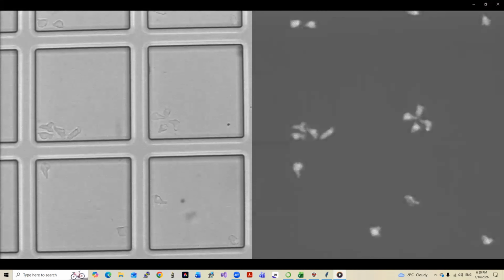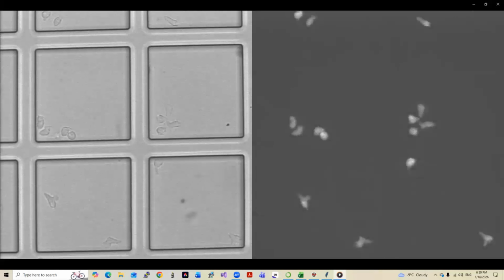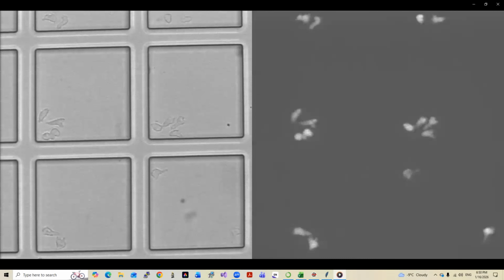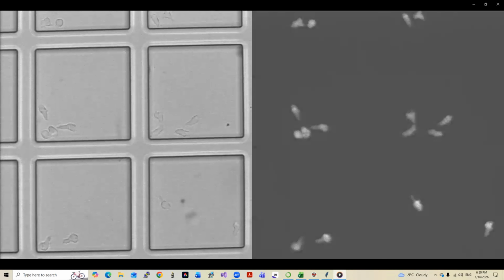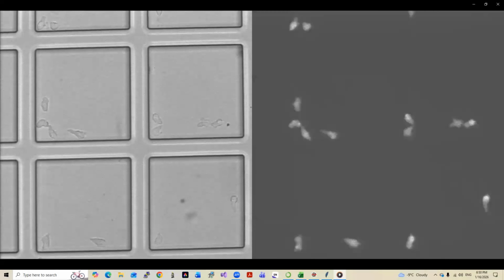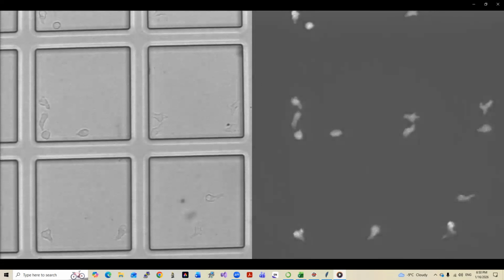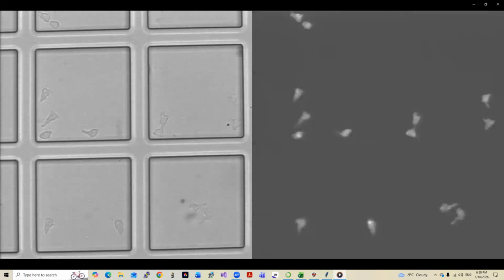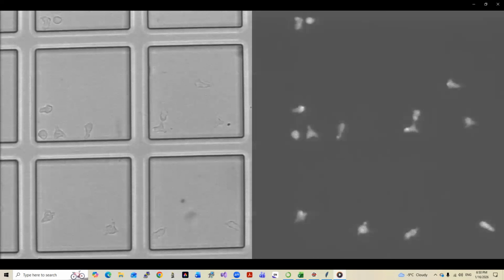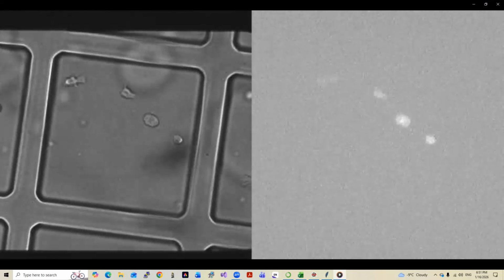Each frame of an input T-cell movie needs to be represented in 2 channels, the bright field channel and the green fluorescent one. The red fluorescent channel is not needed for the algorithm to run, so it can be absent. But if it is present, even in some occasional frames, DeepKymoTracker will output the results for this channel as well. In some movies, like this one, there can be 4 wells. In others, only 1 well.